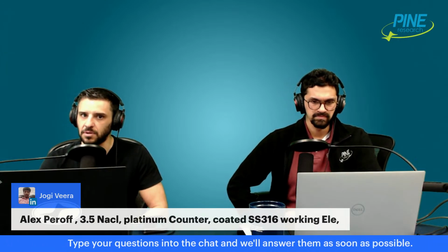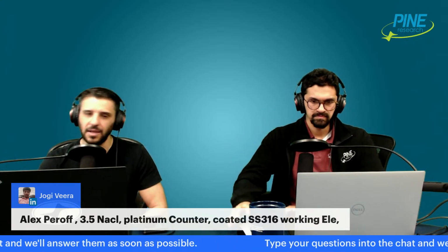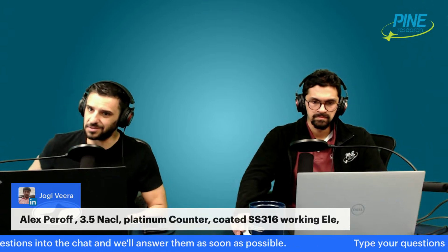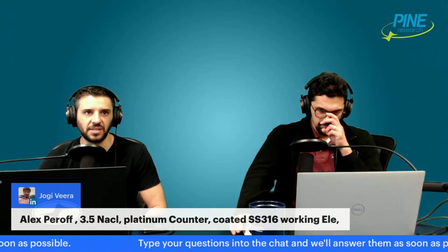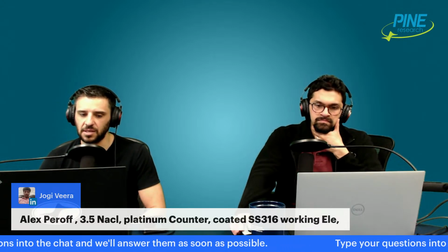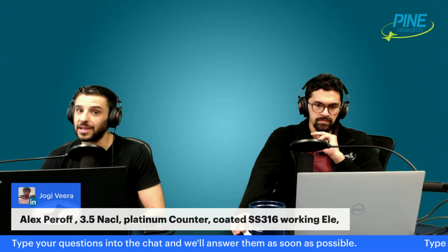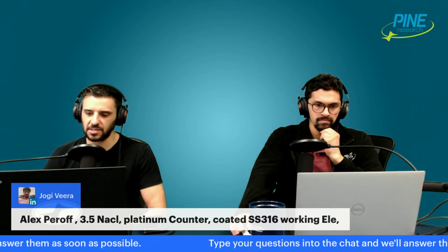It's not really kinetic after a little while. You have passivation layers. That's full diffusional, capacitive kind of stuff. It's not kinetic. There's some gray area here. We all make Tafel plots with 200-300 millivolts of scanning away from OCP, and it's not kinetic data. So the Tafelization of the data is maybe not ideal, especially with stainless steel and these materials that make a passivation layer. They don't corrode very much, so there's not a lot of kinetics. Corrosion is kinetic, so some of that is just tricky.